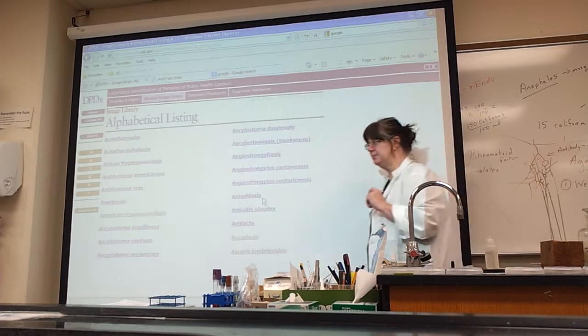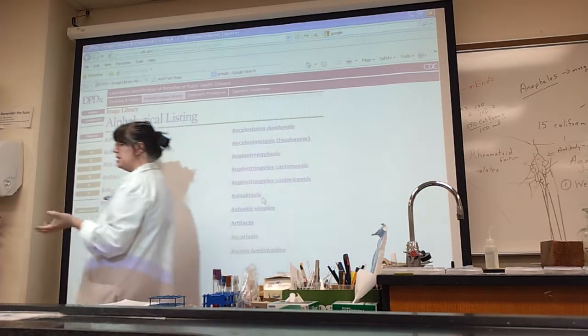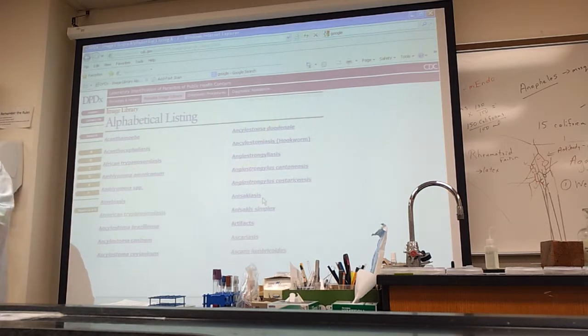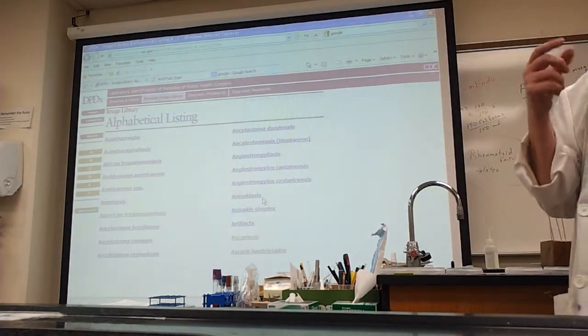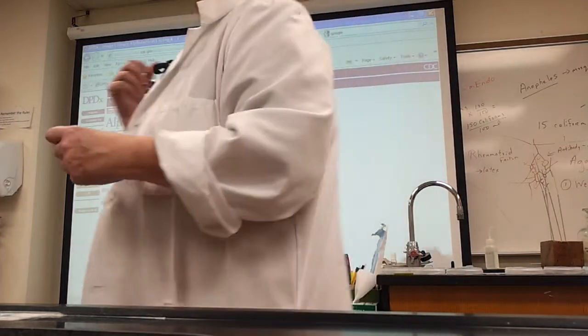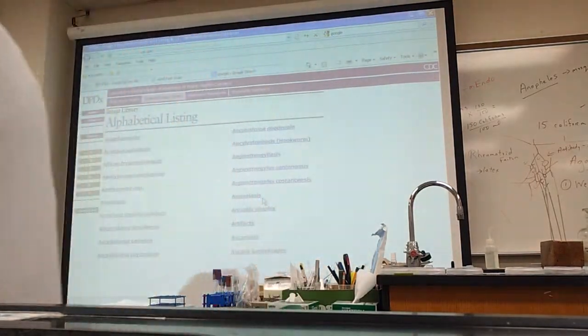Now, amoeba is going to be hard to find in tissue because it squishes through everything. You might see some of the cysts in the brains of people that are infected, but you have to be able to recognize that too. So you probably need to go by the hints on the card, unless you have an experienced eye. What's the hint? The hints will be this.